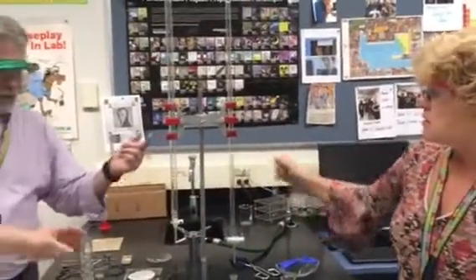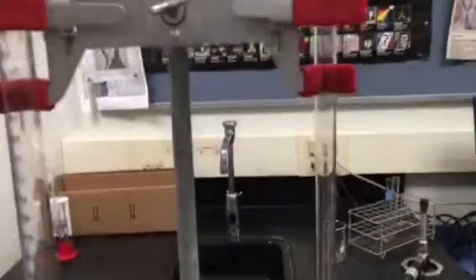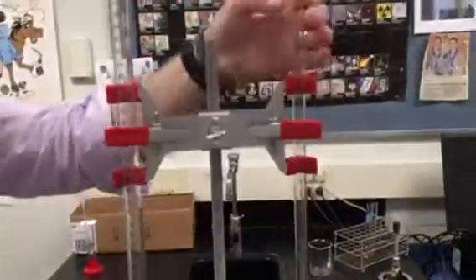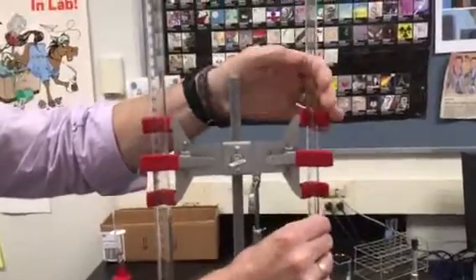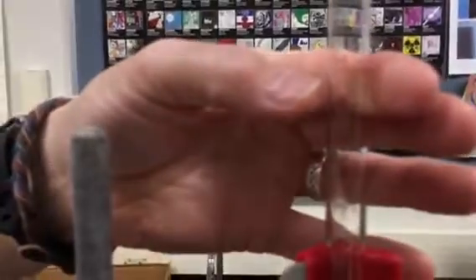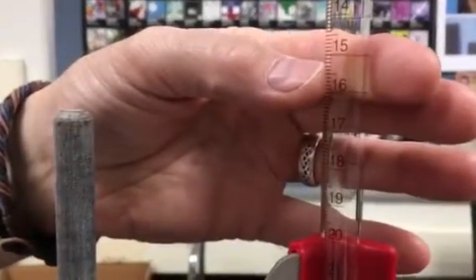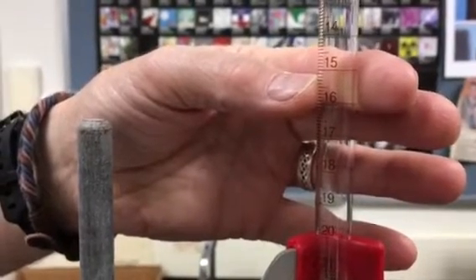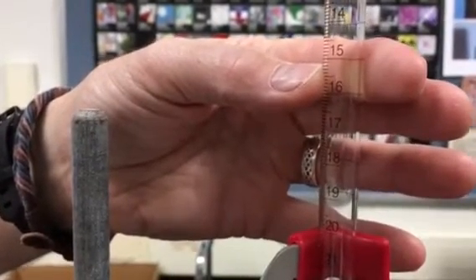Talk about the burette. Burette, much like a ruler. There are 2 types of burette here. This is the one that we're going to use more often, the 50 milliliter burette. And just like the ruler has a scale, the thermometer has a scale, all of these have a scale, we have to apply the same knowledge we have here. So I look at this burette and I see where 15 is, and I see where 16 is, and I can see a mark for 15.1, I see a mark for 15.2, and I see a space between there. So I can get 15.1 guess 3. So 15.13.